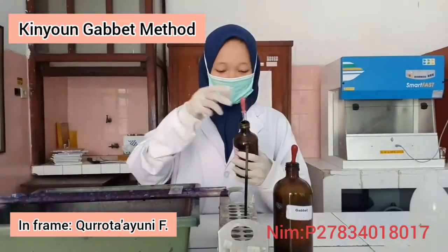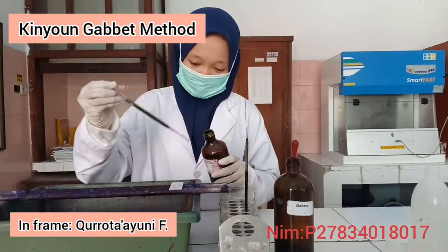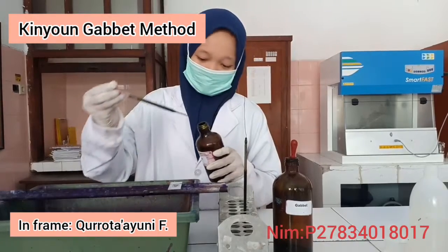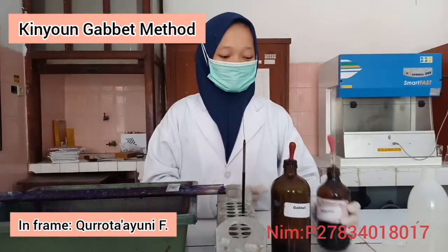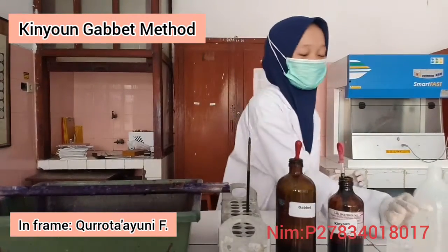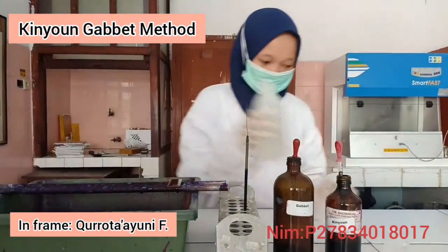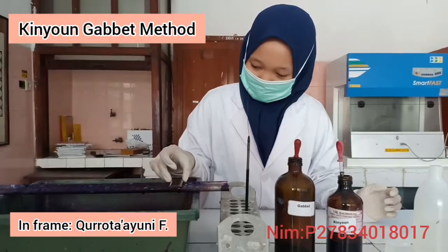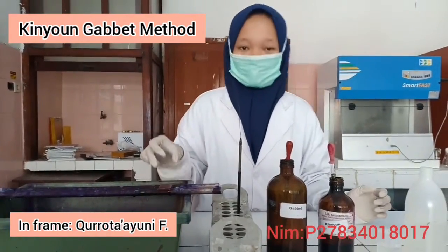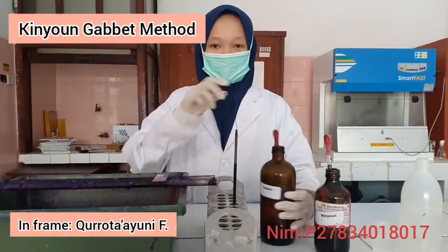Then drop Kinyoun reagent for 3 minutes. After that, rinse with aquadest. Then drop Gabbett reagent for 1 minute.